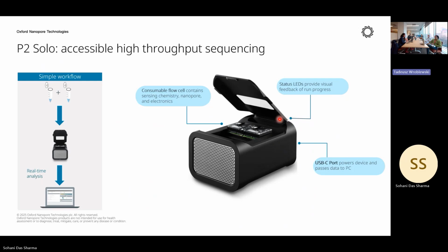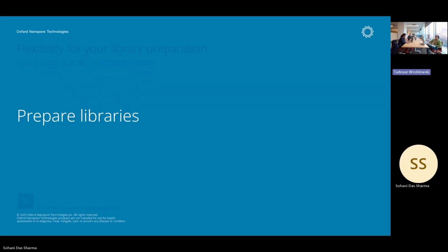This is a good indicator, but I usually check the software to see whether it's going well or whether some error message is popping up. So there are two ways to see it. And it's a USB-C powered device, so there is a USB connection at the end.